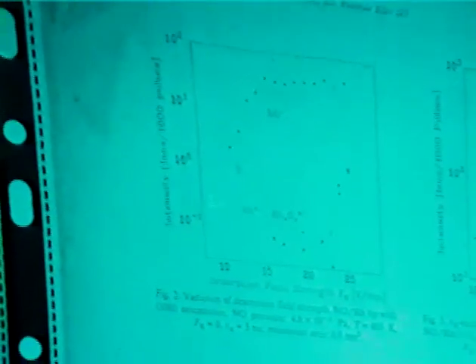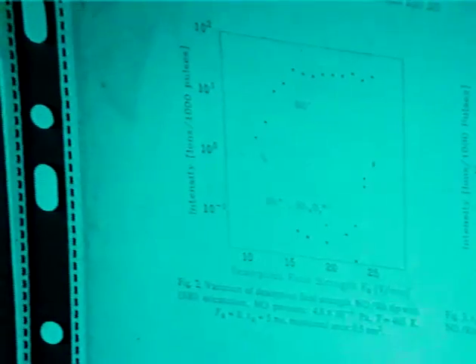This is the desorption field strength of the NO molecule on a rhodium surface. The equilibrium concentration of NO has again been measured at certain reaction times, and we have the equilibrium, and the temperature dependence has been evaluated.